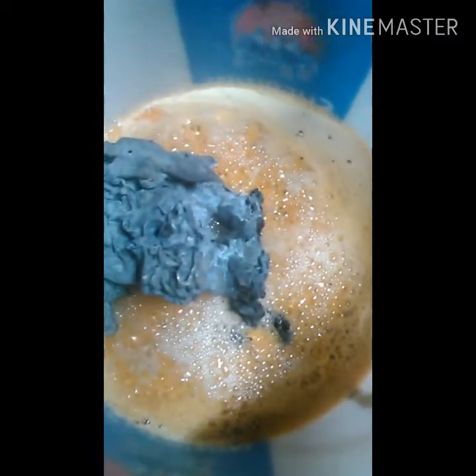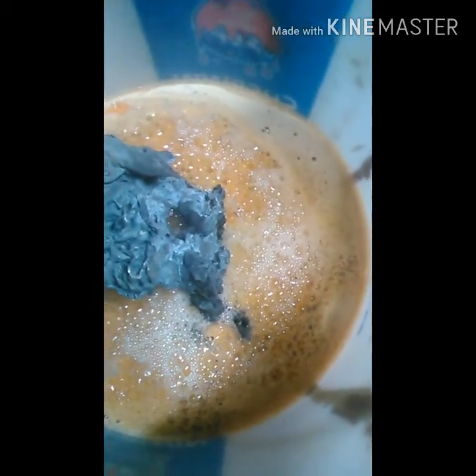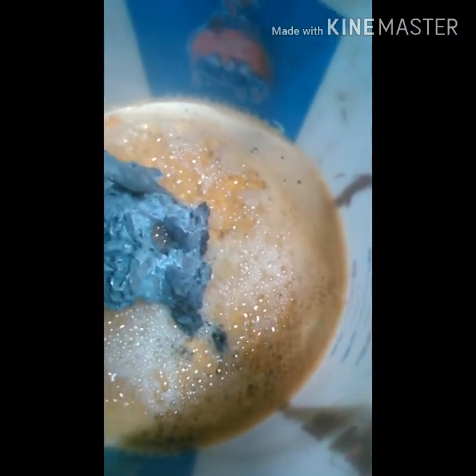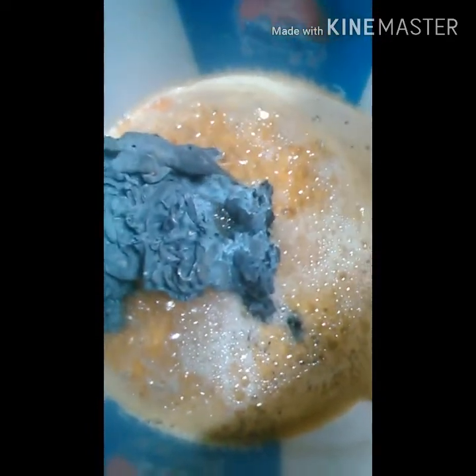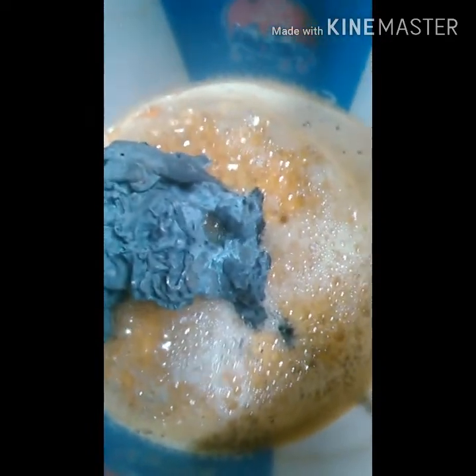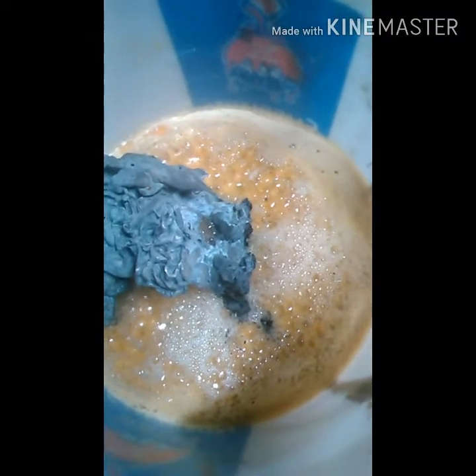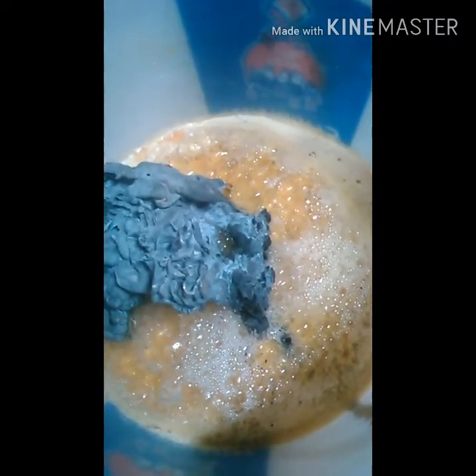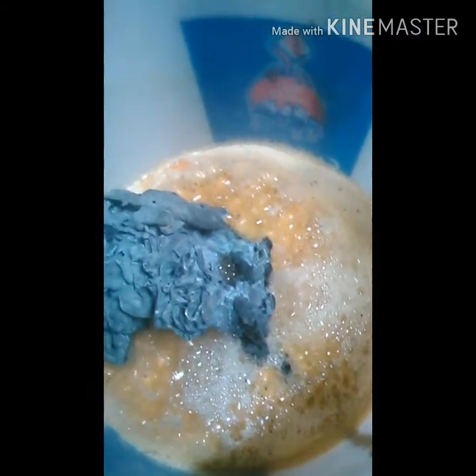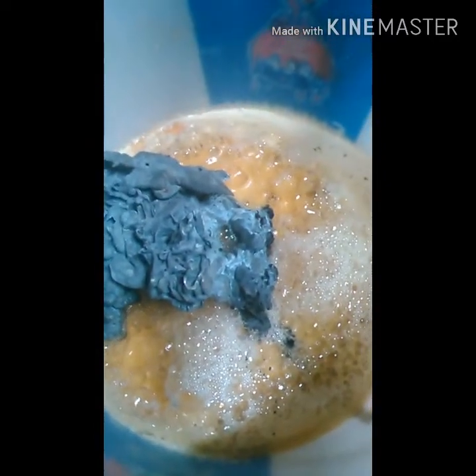I just put my zinc metal in here and you can see it's got a reaction going. One thing to think about when you do your sodium carbonate is you don't want to add so much that it takes away all the acid. Because you need acid to dissolve zinc, so that way the zinc and the platinum group metals can switch places. The more acid that's left, the more zinc you have to dissolve, and the more zinc you dissolve, the smaller your pieces of metal that come out of solution will be.